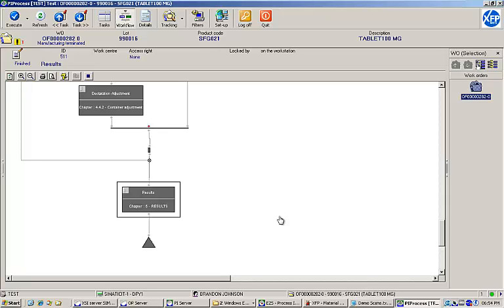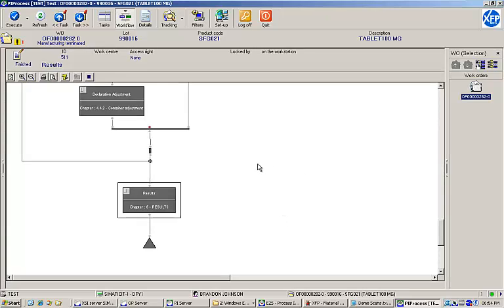From the workflow view of the completed EBR, you can see that all of the tasks have been completed and are shaded gray.